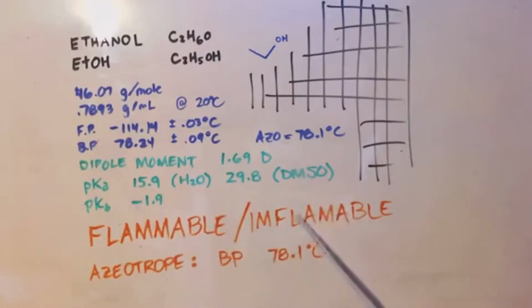I want you to realize, because a lot of people don't understand, inflammable and flammable are the same word. They're synonyms. They mean the same exact thing. The first thing I want to go into is how I do it, and I'm going to tell you a mistake that I've been making in a couple of my videos.